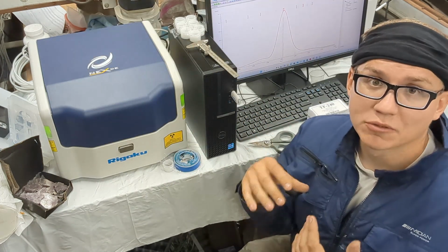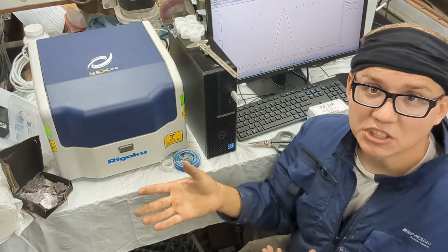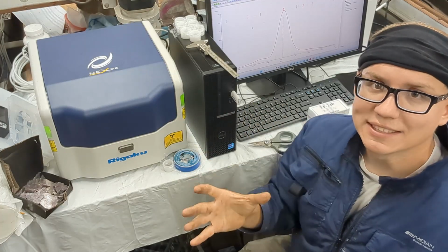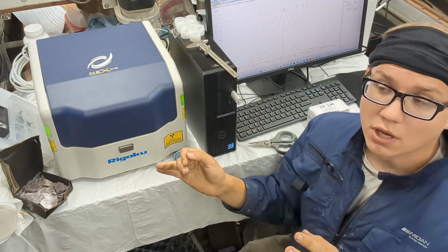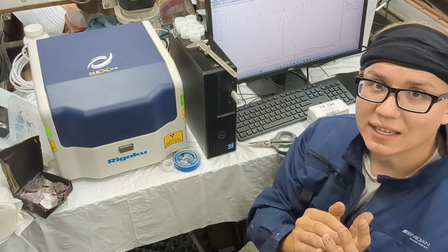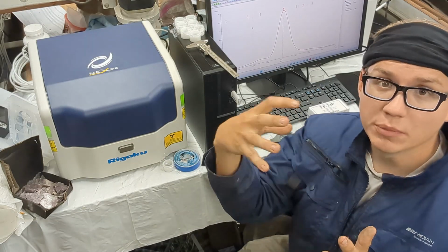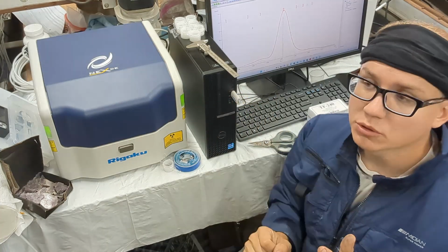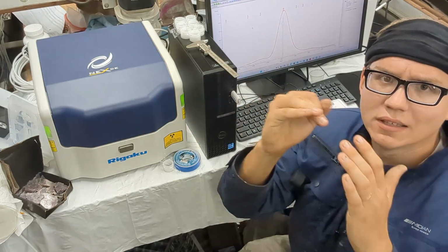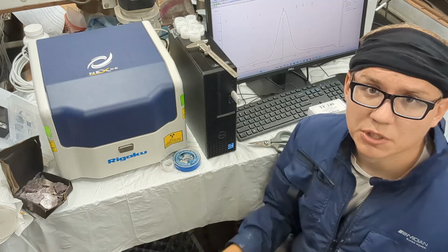The benefit of the CG versus this series is that the CG has less of the background curve that this one would have, because it hits that secondary source that emits its own spectrum at a very specific frequency. You don't have that curve that will cause some issues.